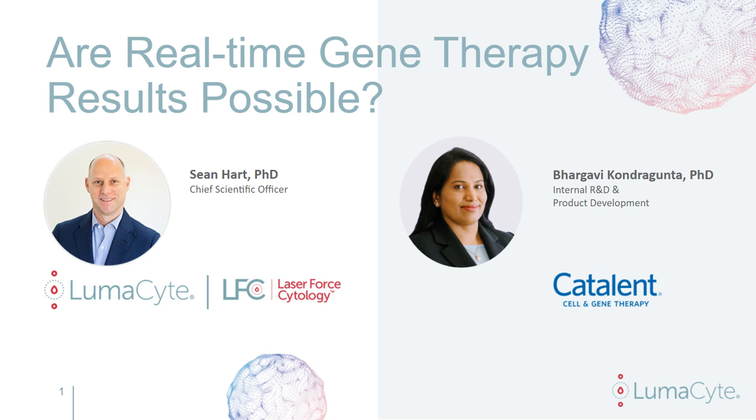Thank you very much, Michael. It's a pleasure to be here. Happy to have everyone on the webinar with us. I'm going to be introducing LumaCyte and laser force cytology in our Radiance instrument, and Bhargavi will be talking about their use of the instrument for a number of gene therapy applications. So let me jump right in.